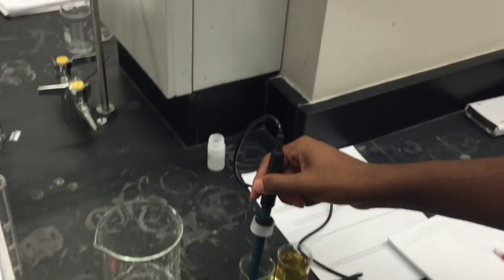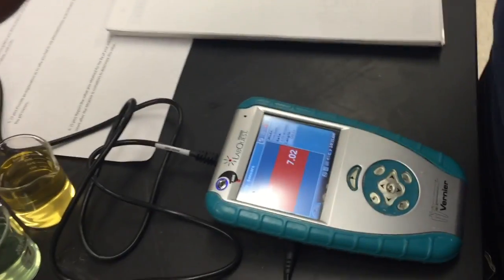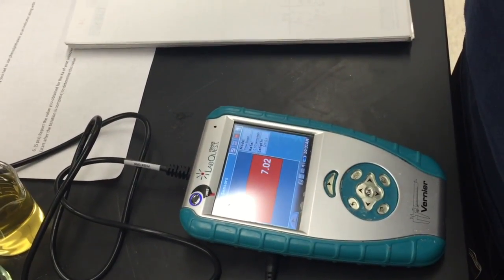While doing this, observe the pH on the meter for any changes. Wait for the pH to stabilize and then record your reading. For instance, here we have 7.02.